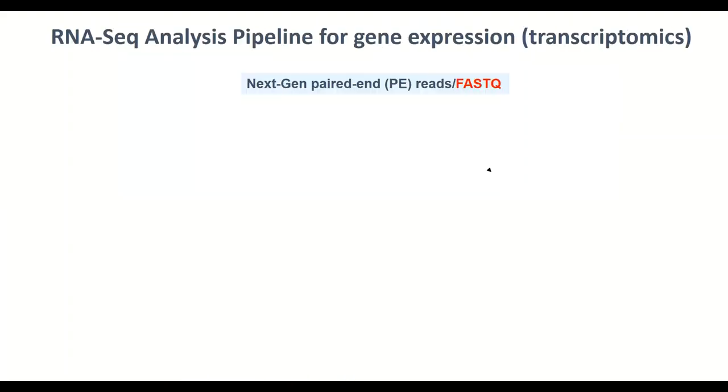And again, we are also interested in the gene expression profile, which we call transcriptomics. RNA-seq data is generated from an RNA sample, while DNA sequence data is generated from a DNA sample, okay? And here I just want to show how we perform analysis for RNA-seq data.